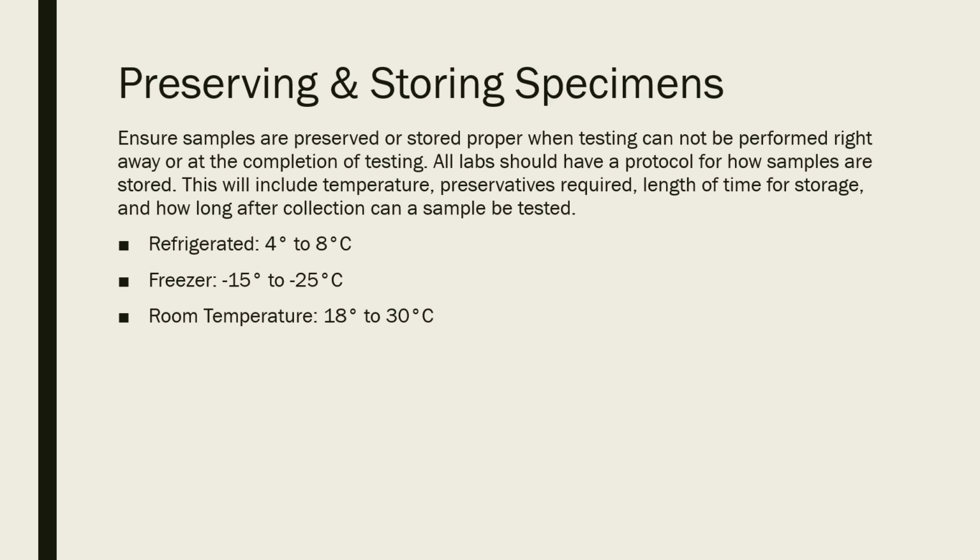When they're looking at your storage requirements, they're also going to make sure that you've checked those requirements on a periodic basis, and they're going to look for a log of that. They're going to make sure that you have kept it within those particular reference ranges. Most labs establish those ranges based off of what the manufacturer says. And so that's something that whoever is setting up that QA policy has to look into.